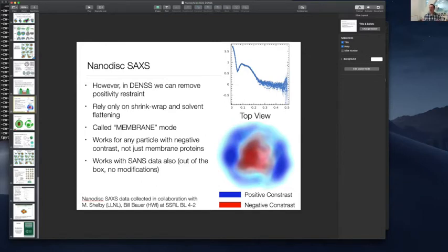You need to deal with ultra SAXS then, right? You have to get to these ultra low angles. In theory, there's no limit to the size, but in practice, the experimental limitations are far more limiting. To comment on that, people do ultraSAXS on whole bacteria to figure out the membrane thickness, because they believe that when collecting ultraSAXS together with the SAXS data, they can figure out the changes in the membrane and the cell wall. But yeah, I will give you some data. I think I have a source for the ultraSAXS of the whole bacterial cells.